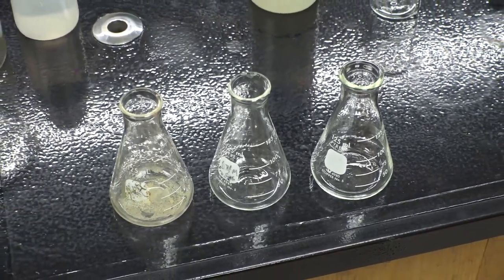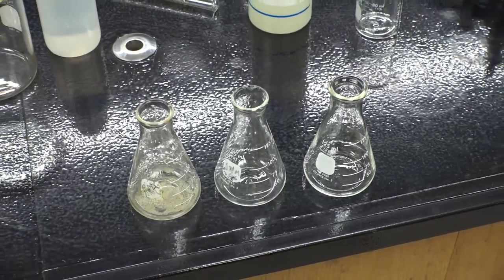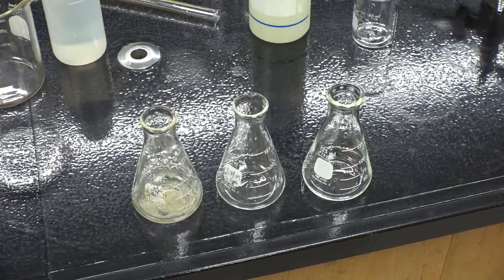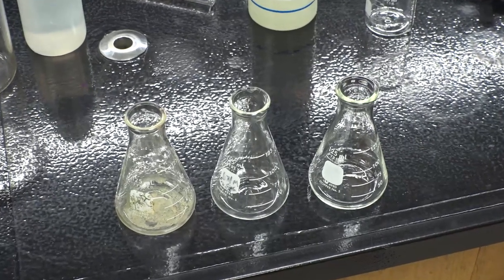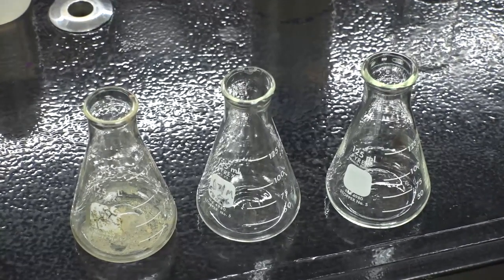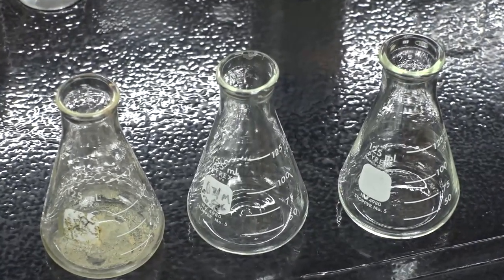One was not rinsed with DI water, the other was only rinsed out with tap water after having a solution of calcium hydroxide in the glassware. Glassware not cleaned properly will have a chance of interfering with the results of any experiment you do due to the contaminants left behind by the previous user.